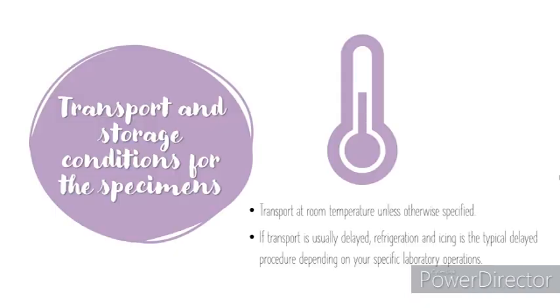Transport and storage conditions for the specimens. Transport usually is at room temperature unless otherwise specified. Delayed transport depends on the type of specimen, but usually refrigeration and putting it on ice is the typical delayed procedure.